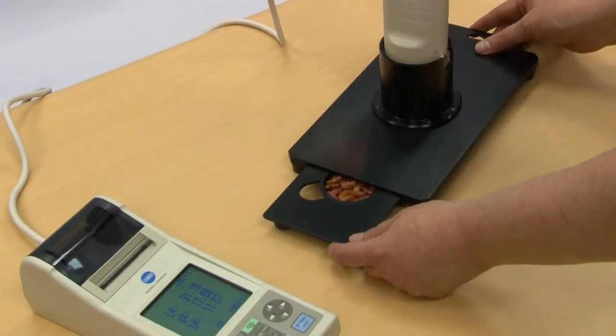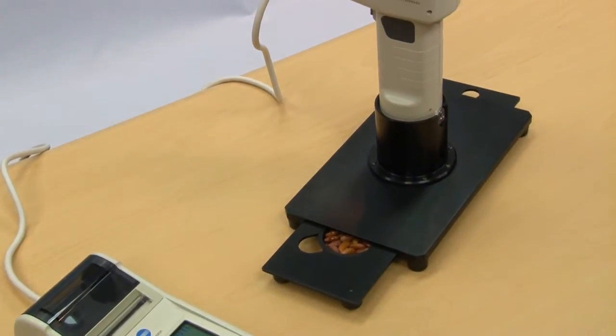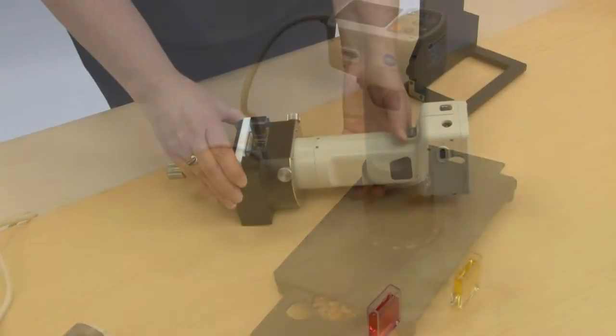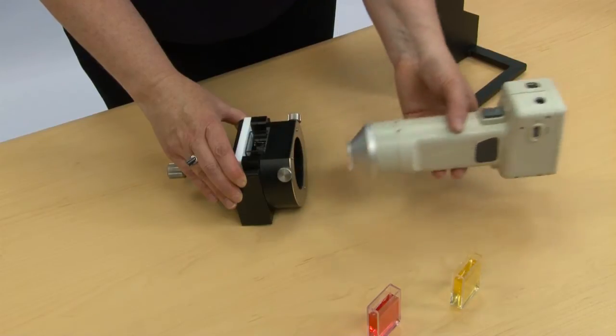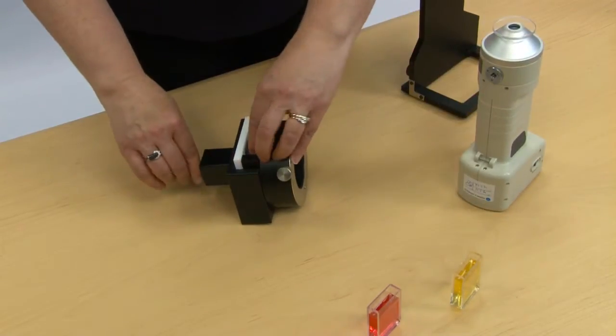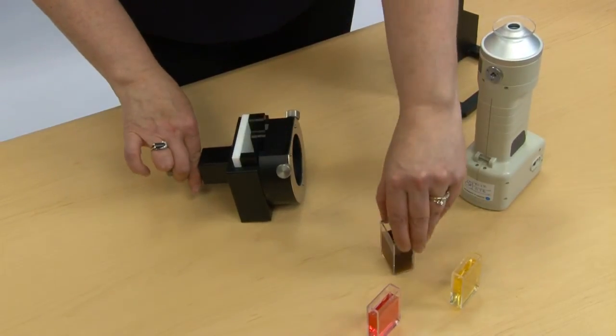Konica Minolta offers a full complement of accessories. The company's optional accessories are capable of handling a variety of samples, including powder, paste, granulars, and opaque liquids.